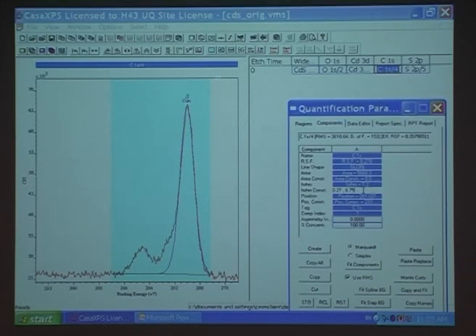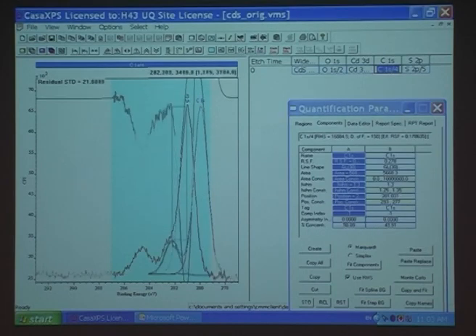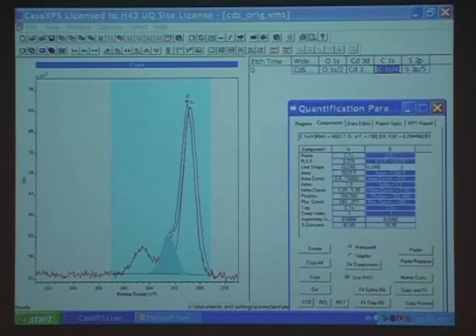I'm going to go then and give it a range of 1.25, 1.35. This is giving it just a little bit of variability. So then the simplest way to add another one, as I said, is copy and paste. Take this peak, bring this one into here. For sure there's one there. Bring this one back. I like to keep them in order, so I click here and go copy and paste.